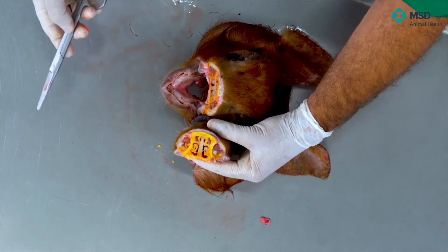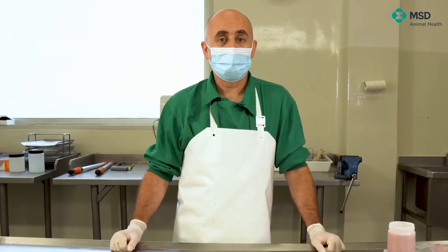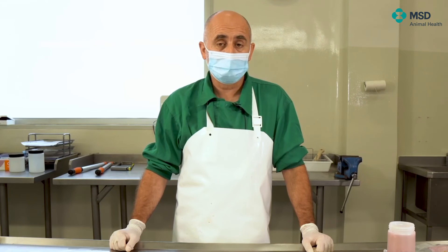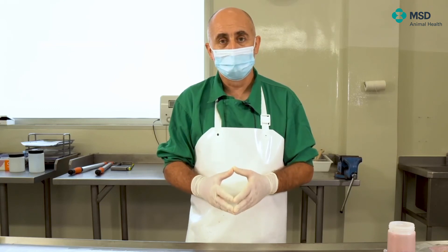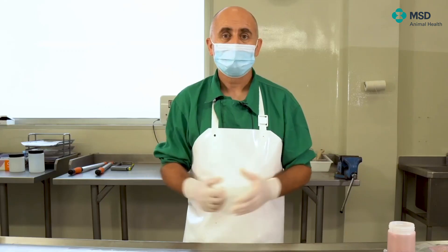You have now seen one procedure for necropsy of a pig. As indicated at the beginning, different systems can be used. But the most important issue is to get all the information that the carcass can provide you. My recommendation in all cases is to try not to forget anything — look at all the organs and all the systems. Use the right tools. And very importantly, when diagnosing a condition, it's very important to select the right pig to necropsy, because if the pig is not representative of the condition you are facing at the farm, results will likely not fit with your clinical problem. I really hope that this necropsy session has been useful for your future work. Thank you very much for your attention.